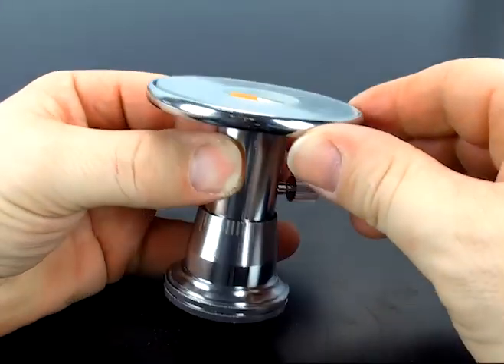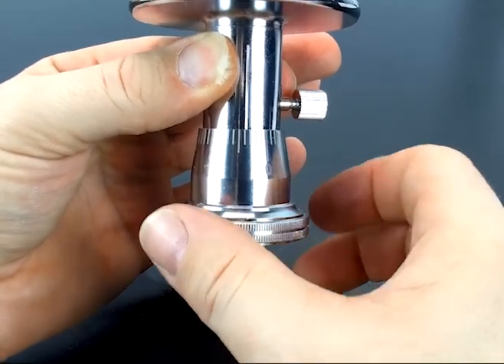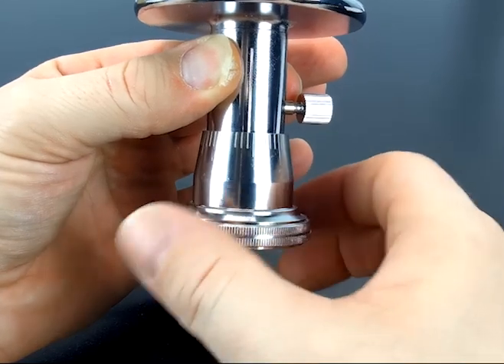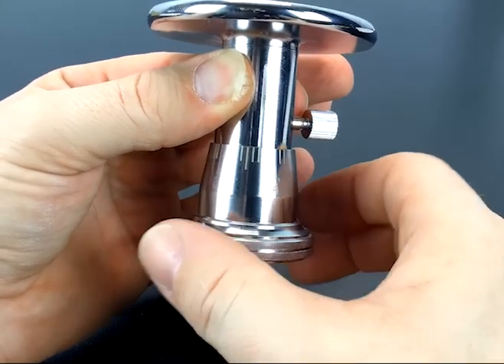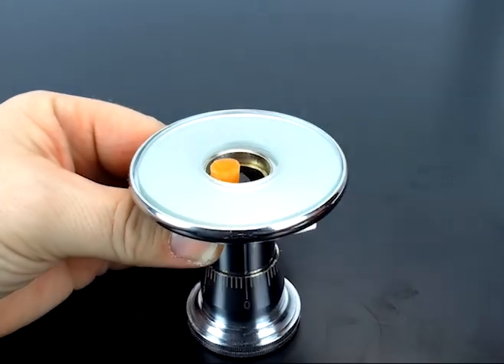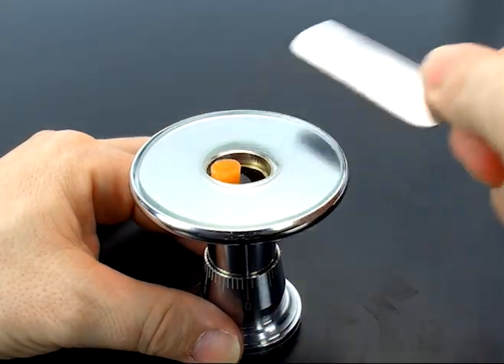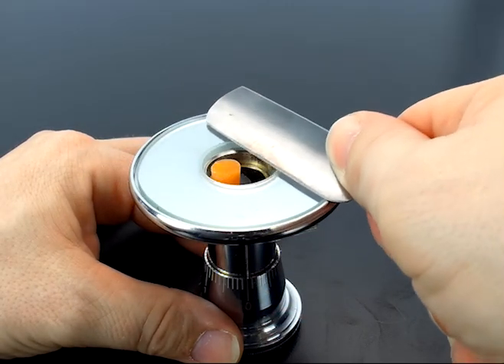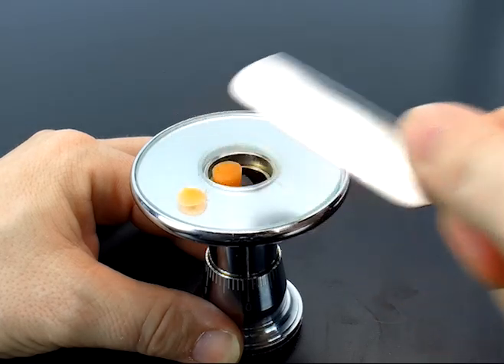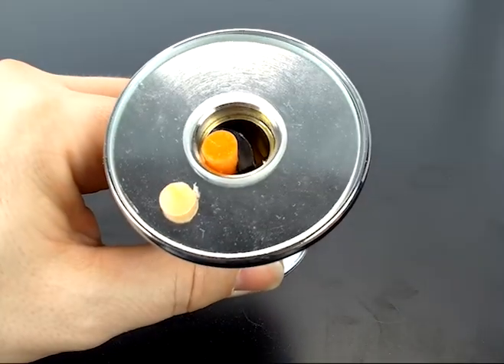Now that you have your baseline, turn the knob until you get to the desired thickness — 100 microns, 200, 300 — I'm going to go all the way around once to give me 500 microns. Then repeat the process again: go parallel and cut the same way you did before. And there is your 500 micron sample.